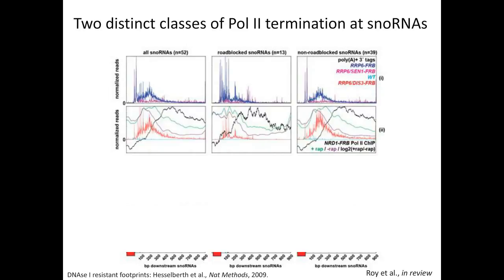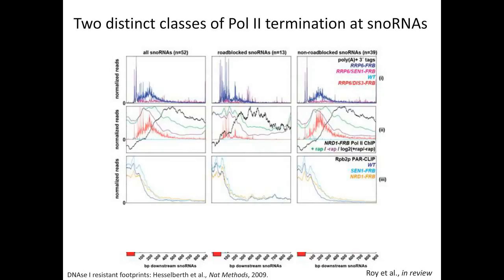And we can then, in the meta-analysis, look at the RNA polymerase II occupancy at these peaks, and we also identify that what we're seeing with the nuclear exosome poly A tails agrees well with the previous regions that have been mapped by Pol II occupancy. But the advantage of the nuclear exosome-targeted poly A tails is that we get a high-resolution view of where the transcription is actually terminating. And we were also able to verify, in comparison with the PAR-CLIP RNA cross-linking data, that these poly A tails were mapping well with these data.